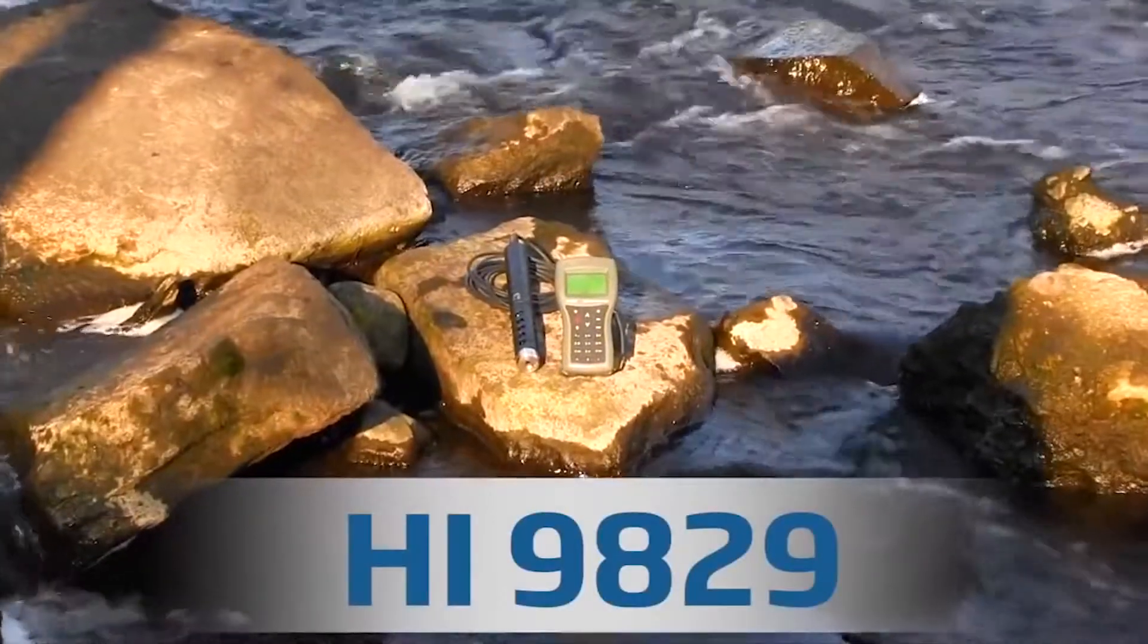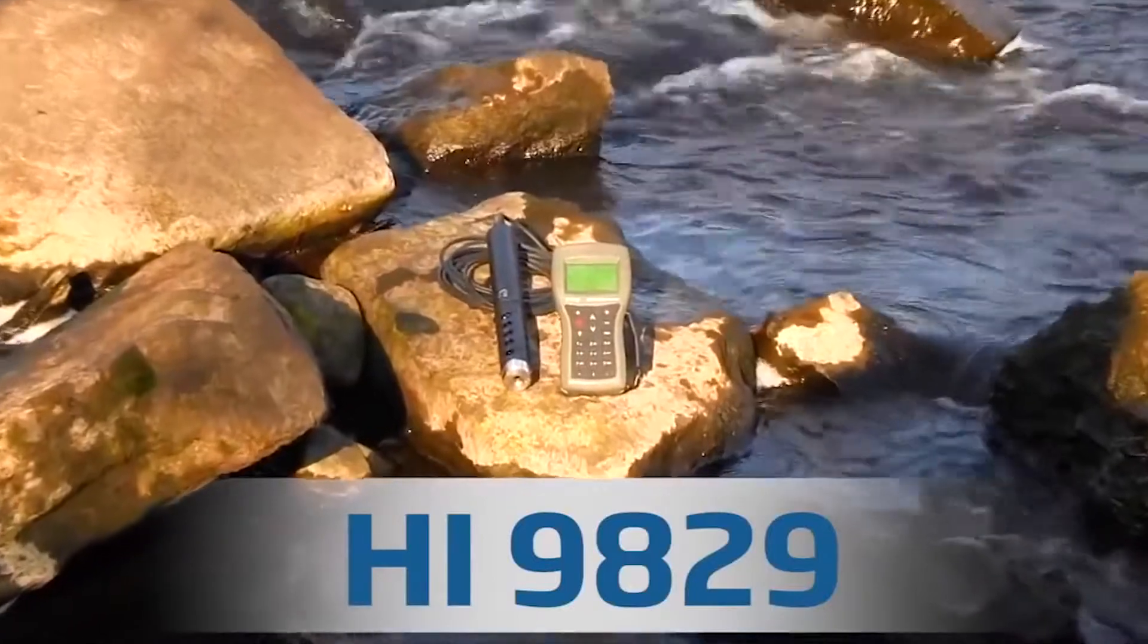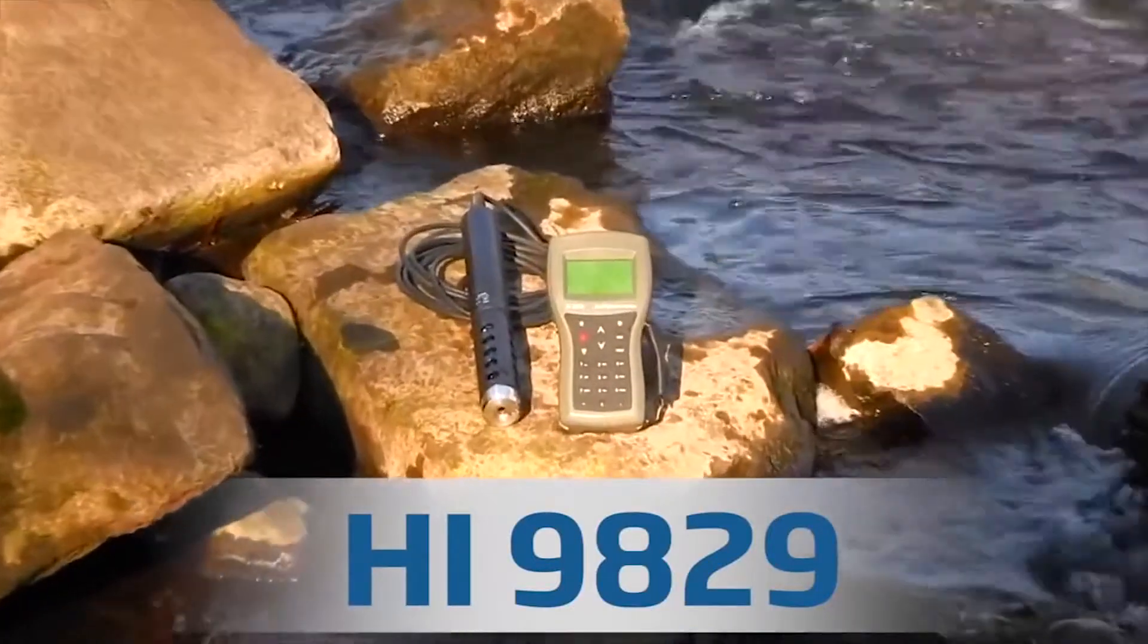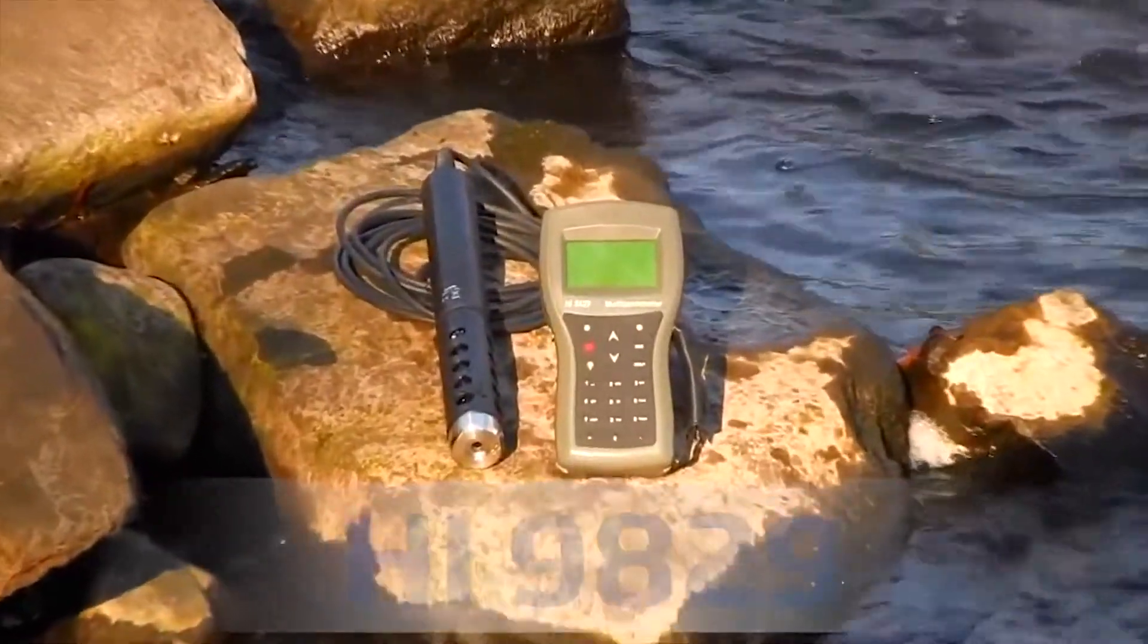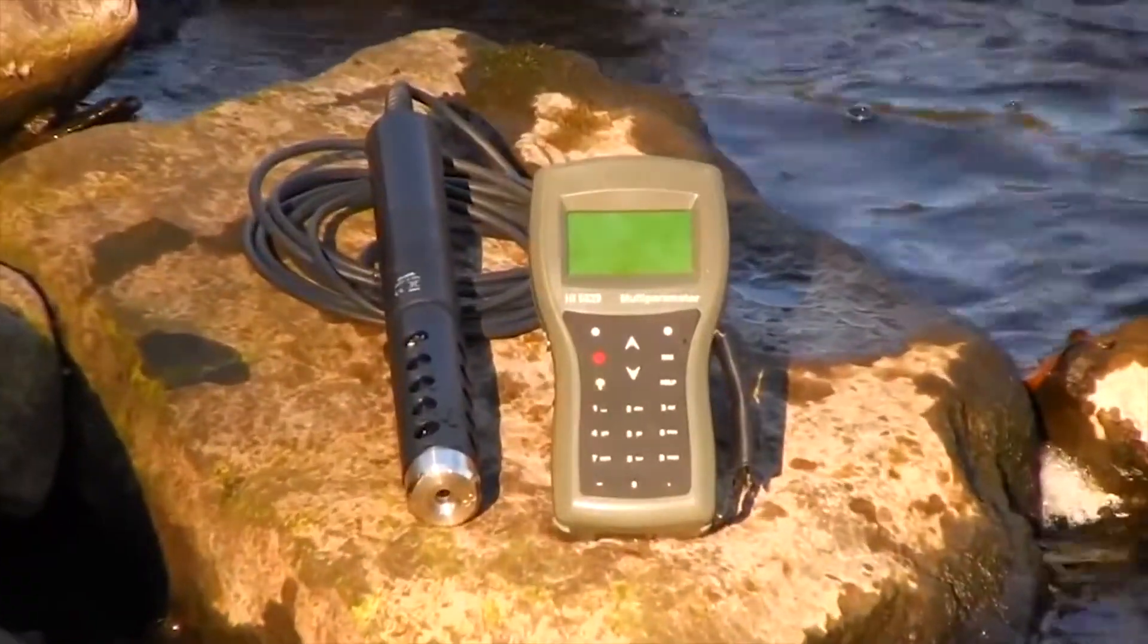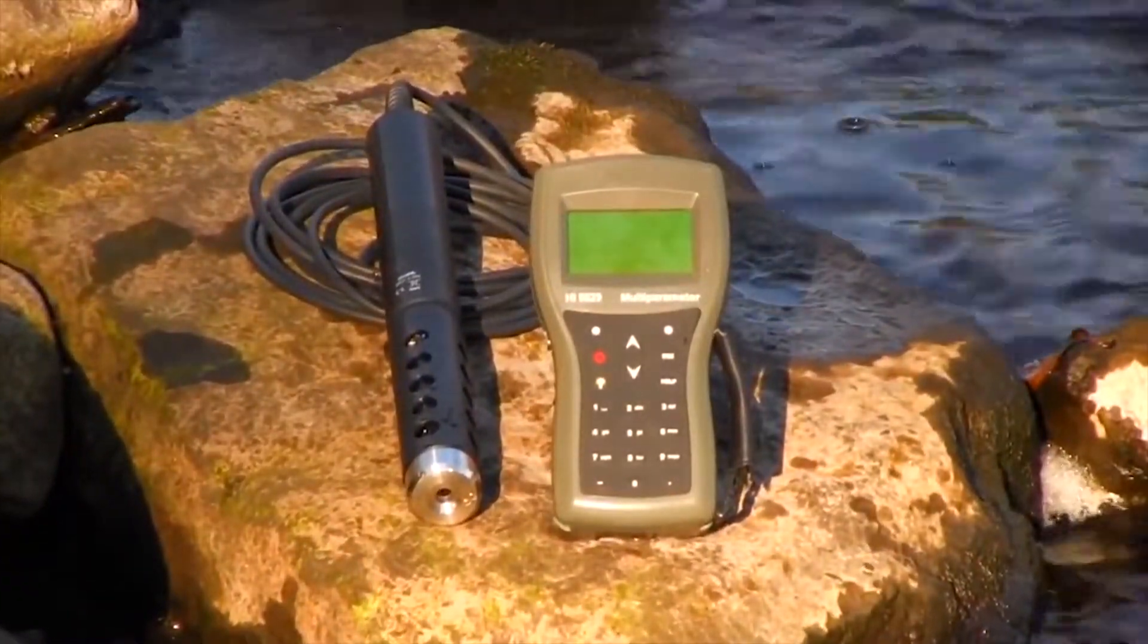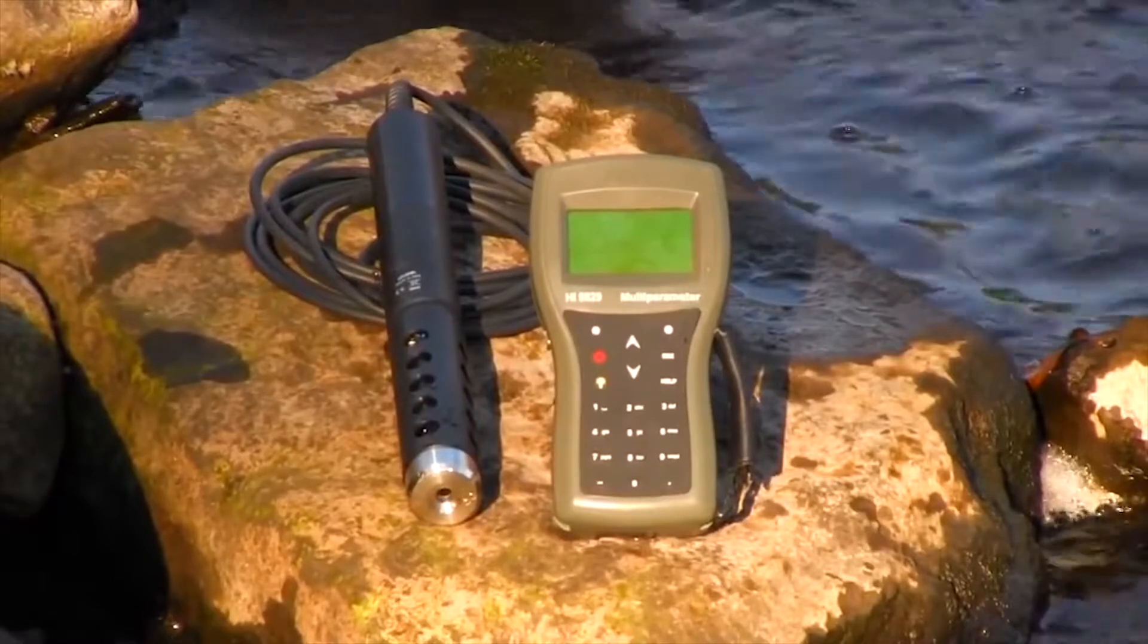The HI-9829 multi-parameter portable meter with GPS is the perfect tool for monitoring environmental water applications.